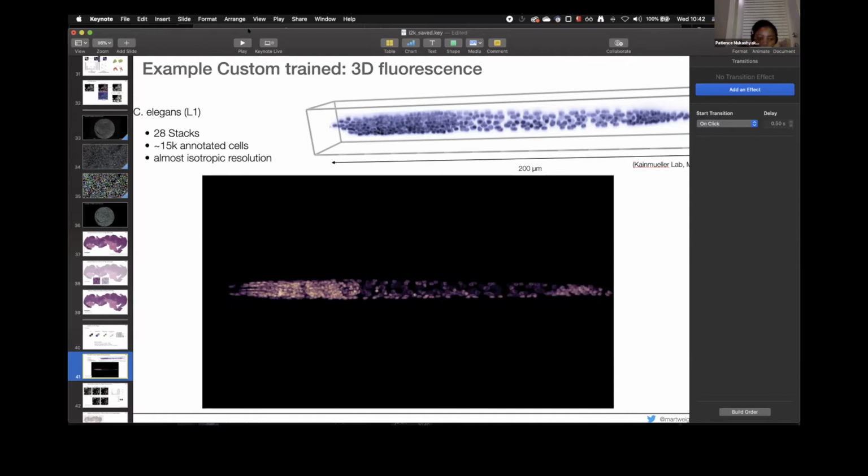Maybe if I can jump in, just one last little question here for the number of rays. Usually in these images, when it's nuclei, the number of pixels in a nucleus is relatively small. So 32 rays will give you quite good accuracy of the reconstruction, right? But now if I'm segmenting a larger object, which can still follow your approach, my pixel density is much higher, because this object is larger. Should I then go for a larger number of rays to reconstruct the edges better, or should I downsample my image to fit what a nucleus would look like?